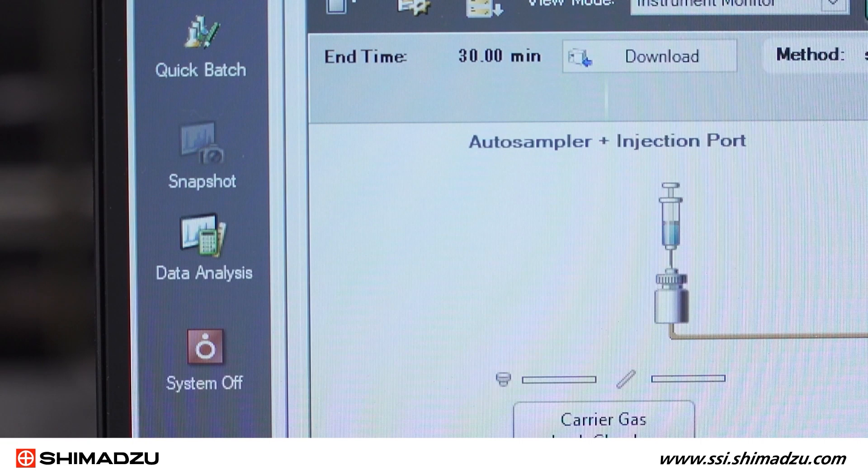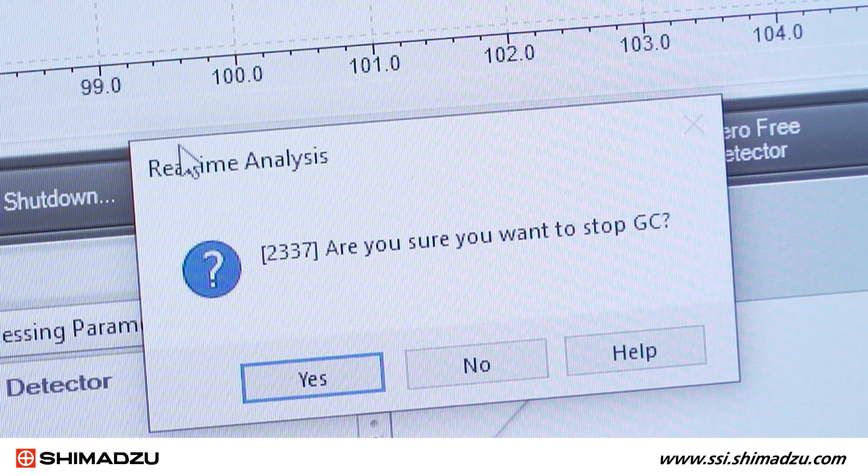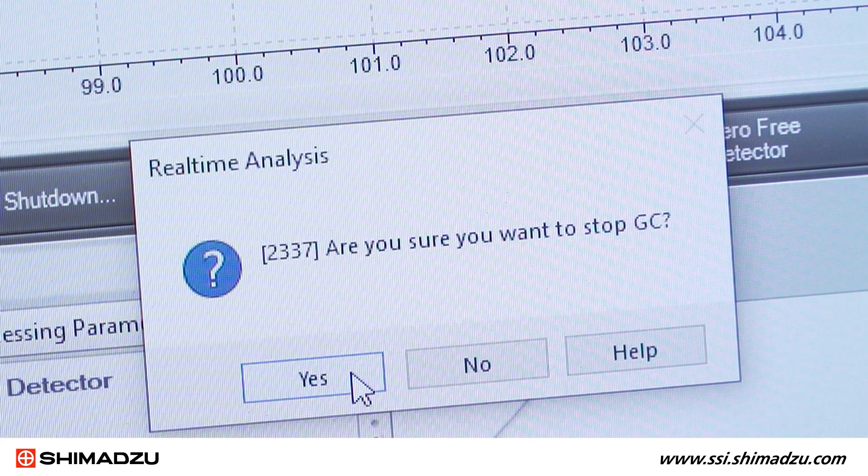From Lab Solutions software, you can either press System Off in the Acquisition menu at the left, or press System Off from the toolbar at the top. Then verify that you want to shut down the GC by clicking Yes in the pop-up window.